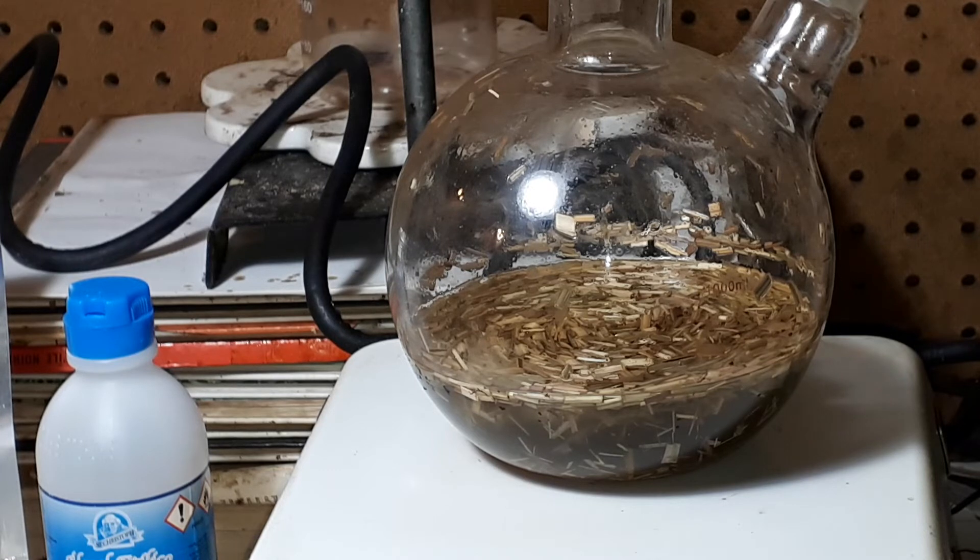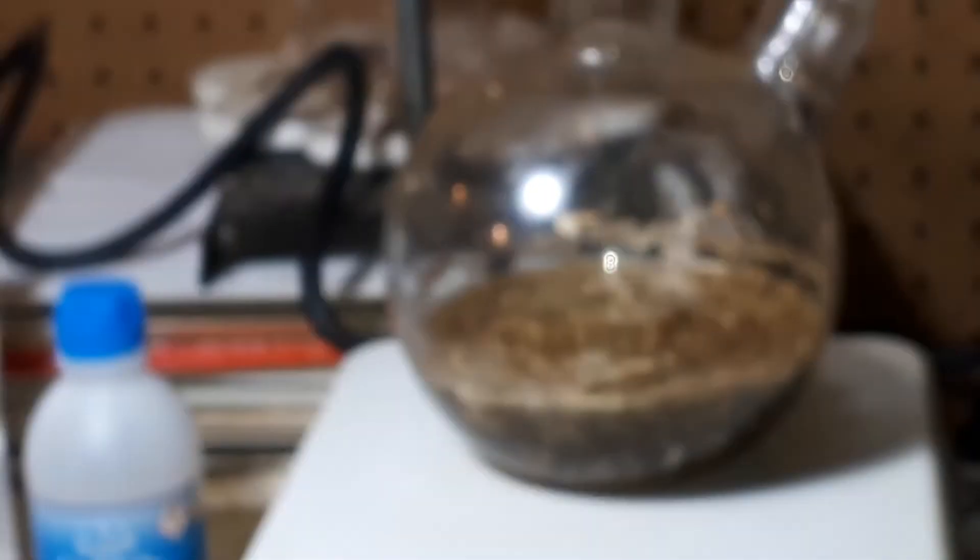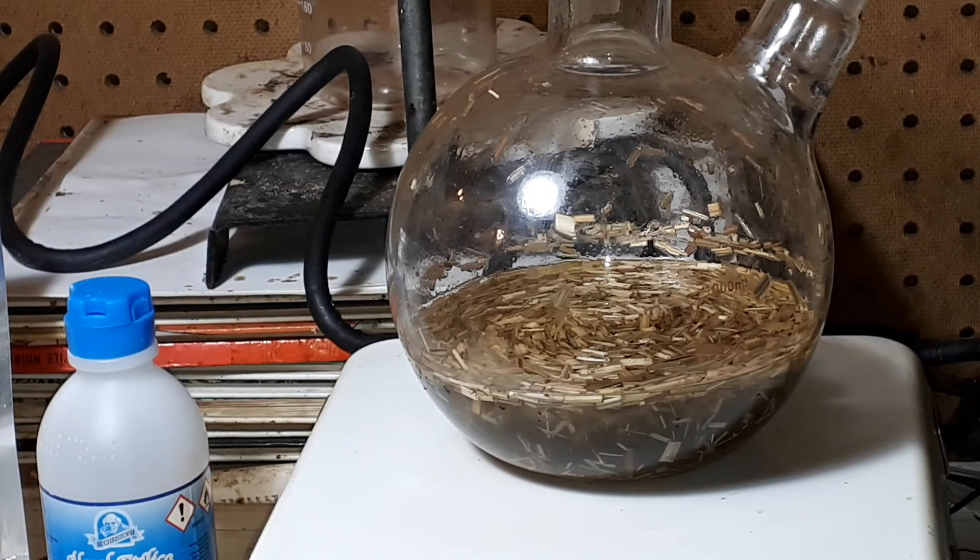If I can remove the glass stopper on here, I can really smell the aroma.